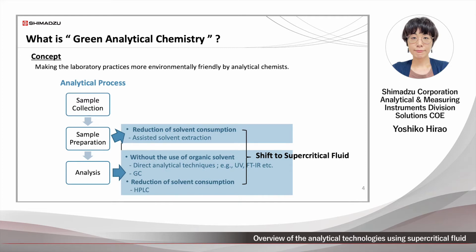In this topic, I'd like to introduce the actual analytical technique using carbon dioxide, which is beginning to be used as a part of green analytical chemistry.